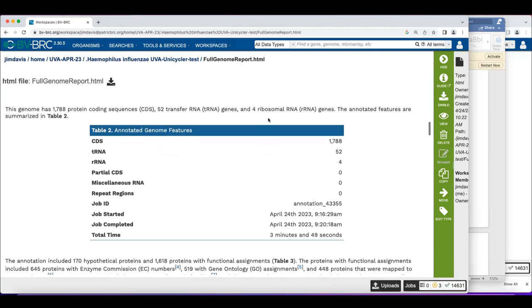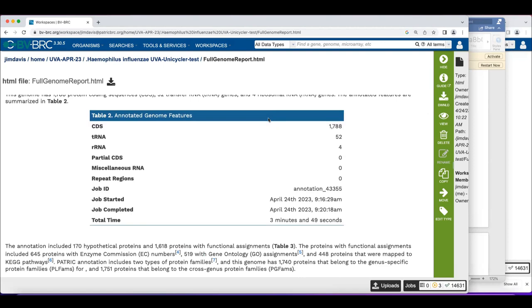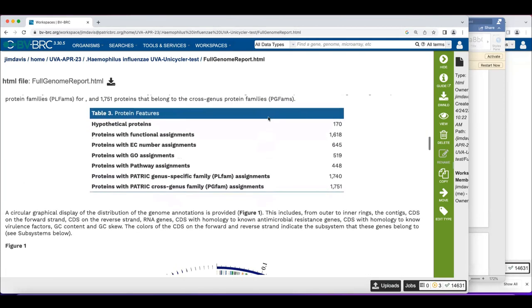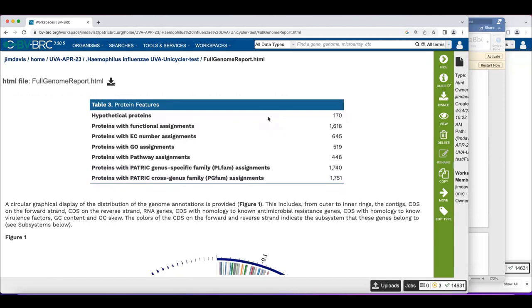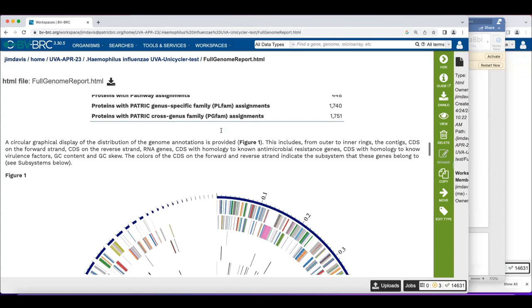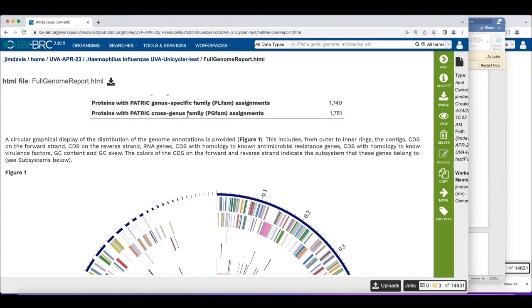In the annotation section of the genome report, we got 1,700 CDS — coding sequences — 52 tRNAs, and four ribosomal RNAs, which looks pretty good. Then we get a high-level overview of protein functions: hypothetical proteins, proteins with functional assignments, proteins with EC numbers from the Enzyme Commission, GO assignments, pathway assignments, and protein families — both local genus-specific families and global cross-genus families.